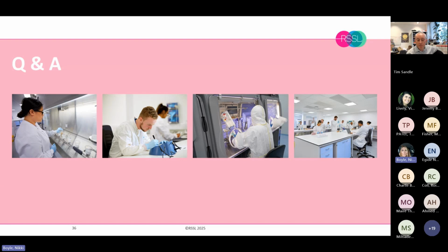One final one, unless the audience have got anything they want to pop into chat, and I'm going to try and get the pronunciation of this word correct. Which sporicide is the safest to use? There isn't really one, actually. So it answers the question that comes up.